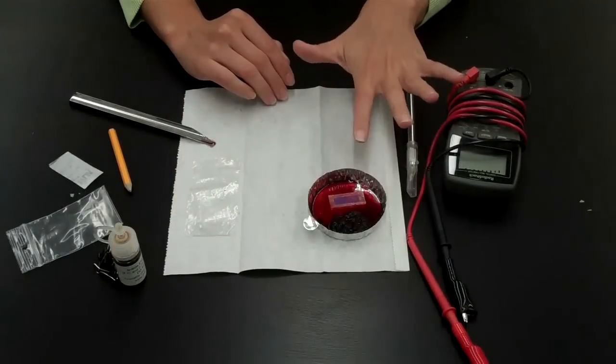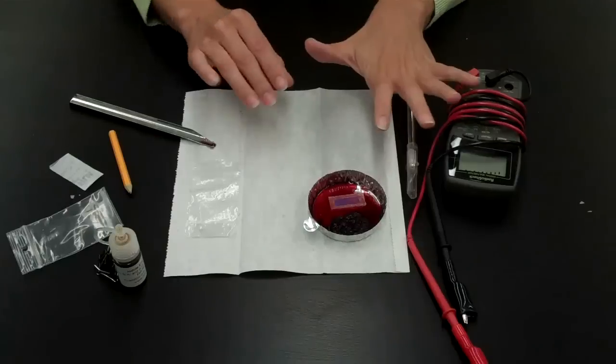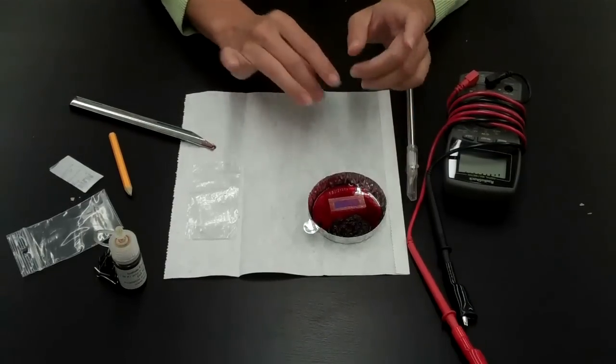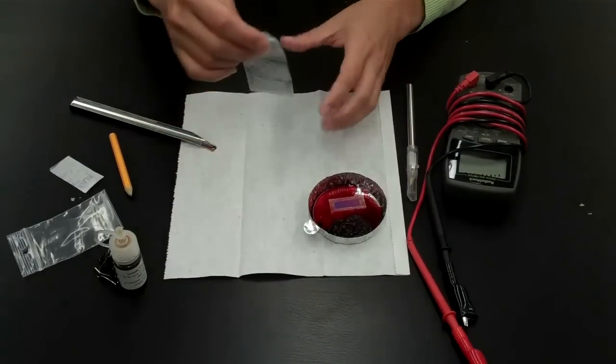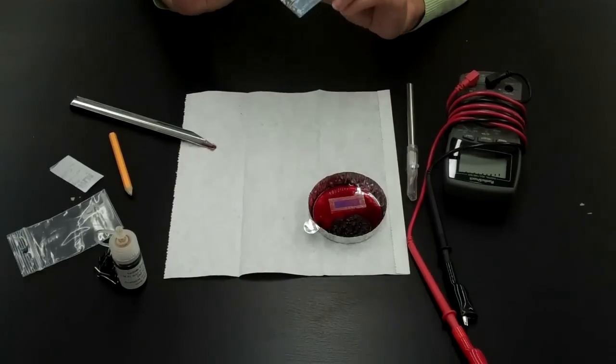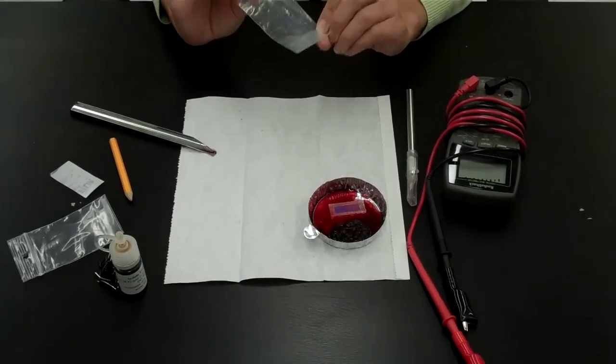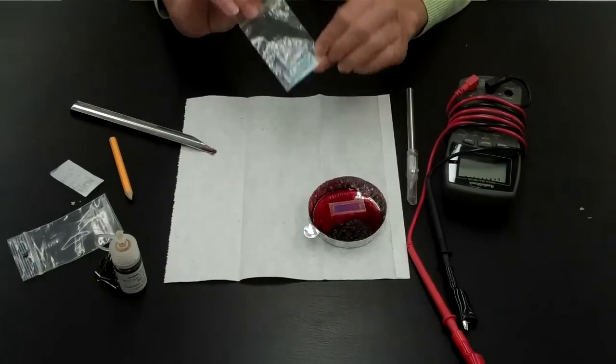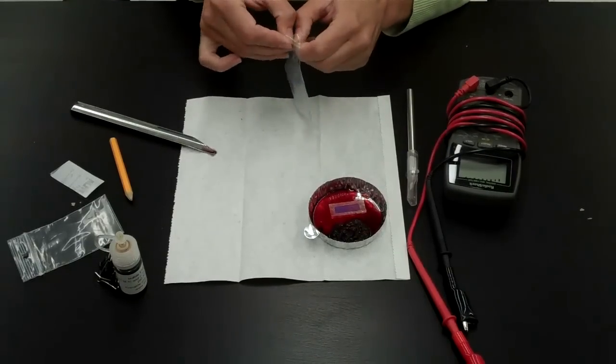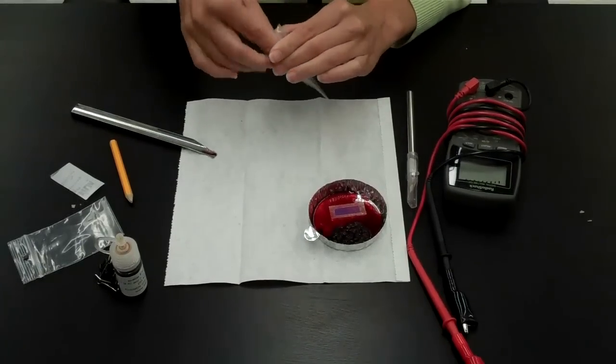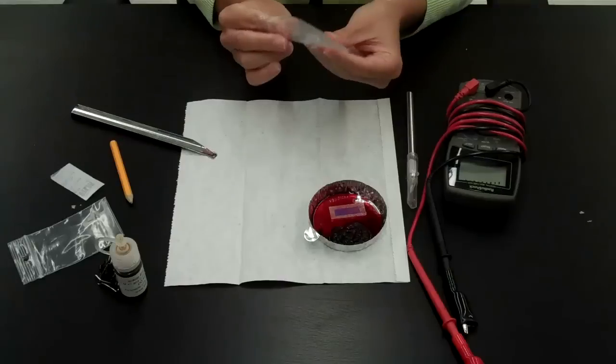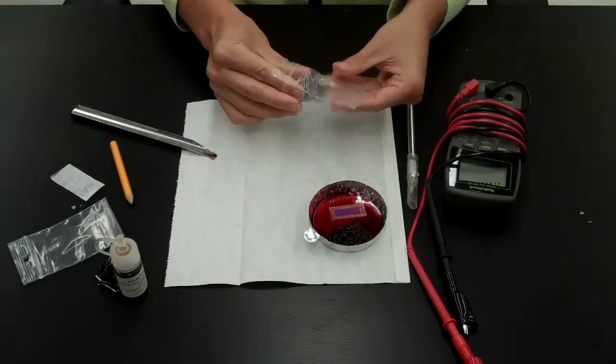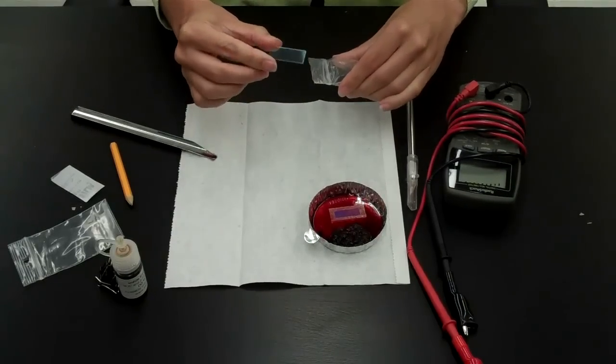While your titanium dioxide slide is dyeing, you then can remove your transparent slide, which is coated with indium tin oxide, but only on one side, so you'll need to identify which side has the conductive coating. Again, remove the slide using only the edges.